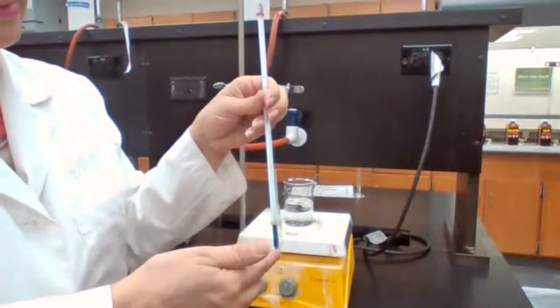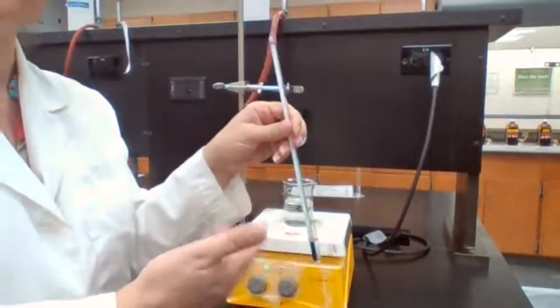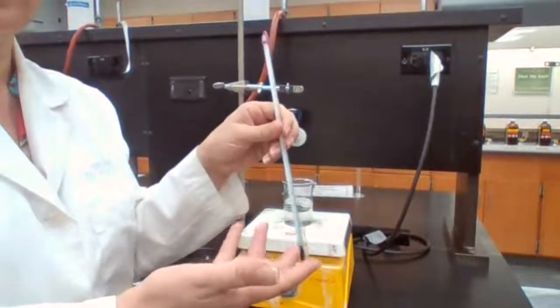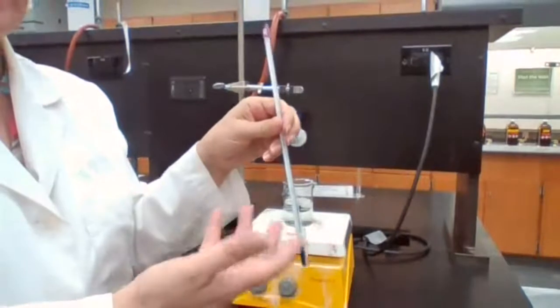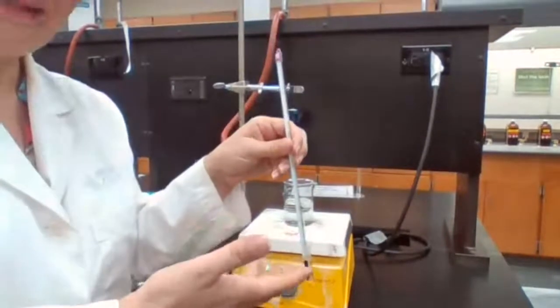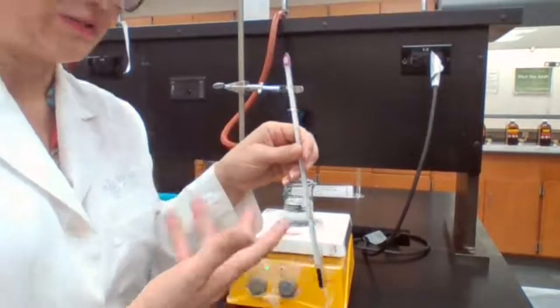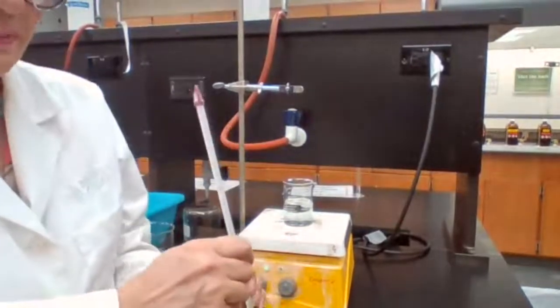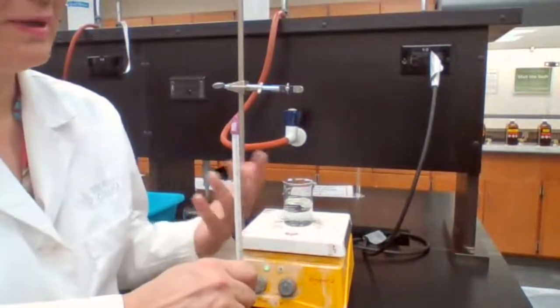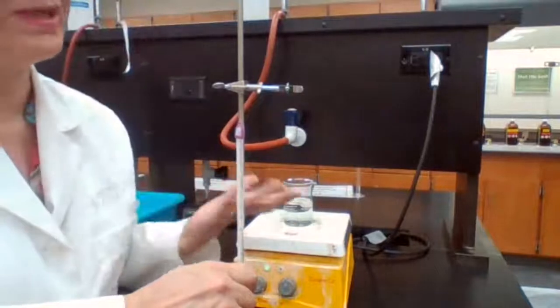But the boiling point that I'm recording at this point is still going to be accurate, plus or minus like 1 degree Celsius, which is still a good piece of information to identify a compound. Density is a physical property of a compound. Same thing for boiling point, and the color and the odor. All of that can help me to identify my compound.